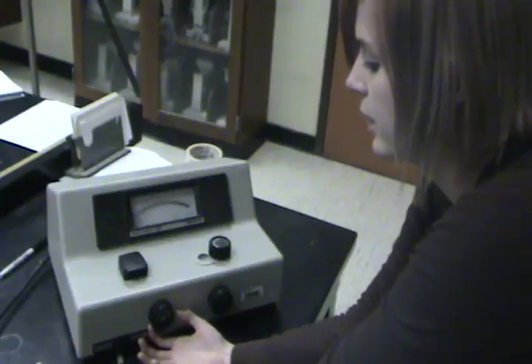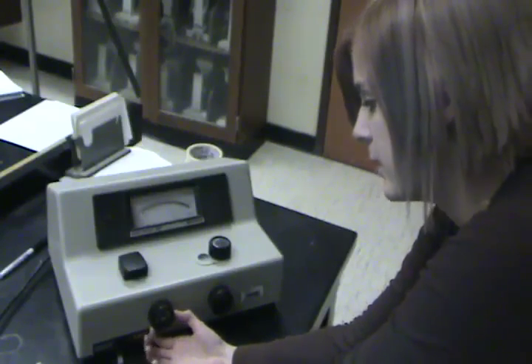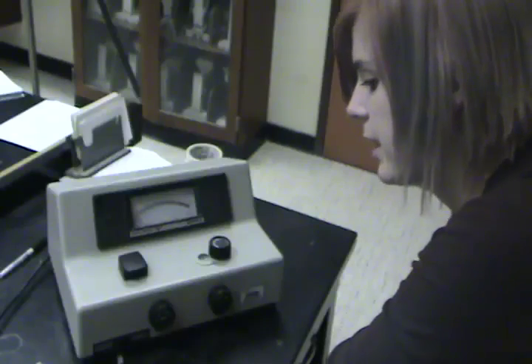Then we turn the left transmittance knob to 0% transmittance. Now our machine has been calibrated.